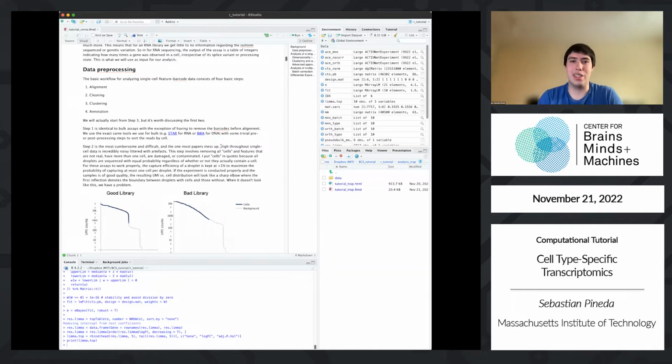Things like, you have a droplet that looks like it came from 2 different cell types. You want to call it a doublet and remove it. But the truth is, you might have some cell that is in the middle of some developmental trajectory, in a transient stage where it has both oligo and OPC marker gene expression. So it really depends on what you're profiling, and no two dissimilar data sets are going to be cleaned the same way.